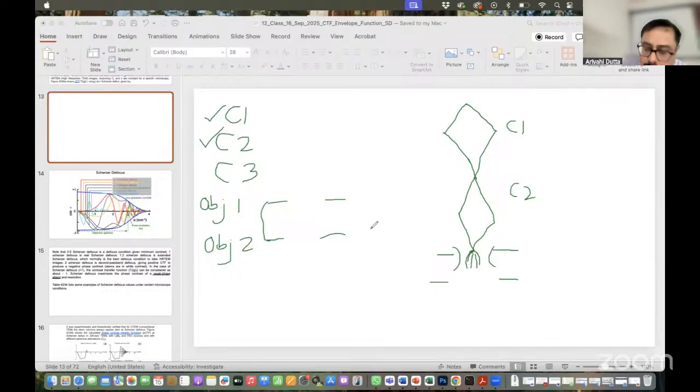So what you are doing basically is, okay, you have a crossover point here, and then you are trying to make the electron beam come in this fashion from your crossover point. And that crossover point will be this one, the second crossover point. Basically, we are trying to make this one parallel like that.